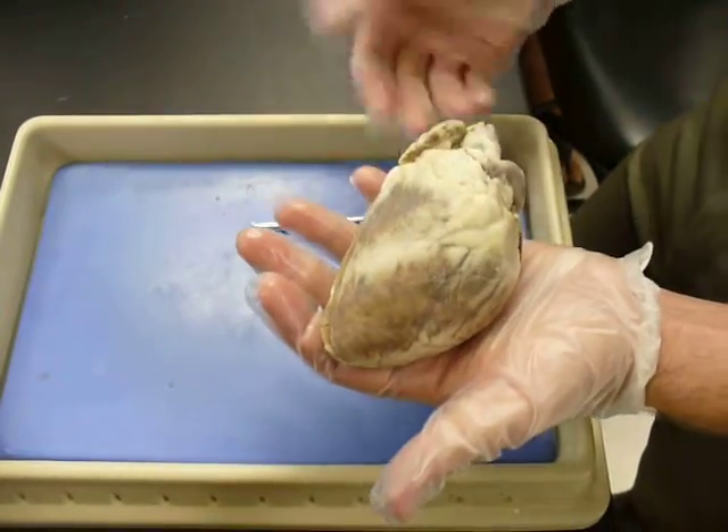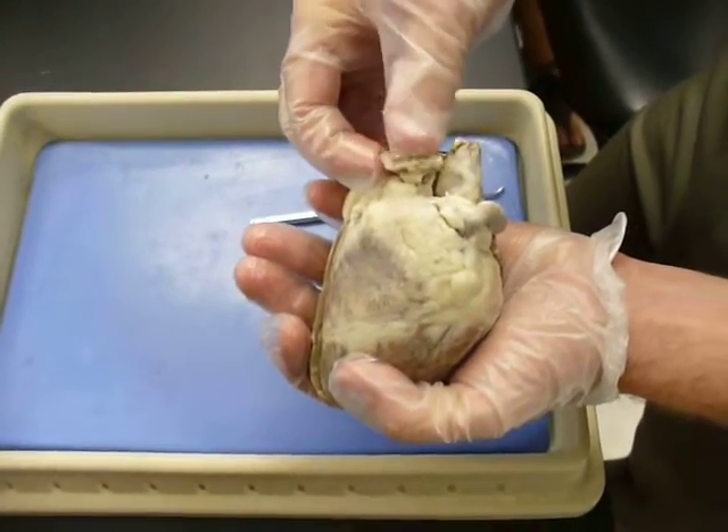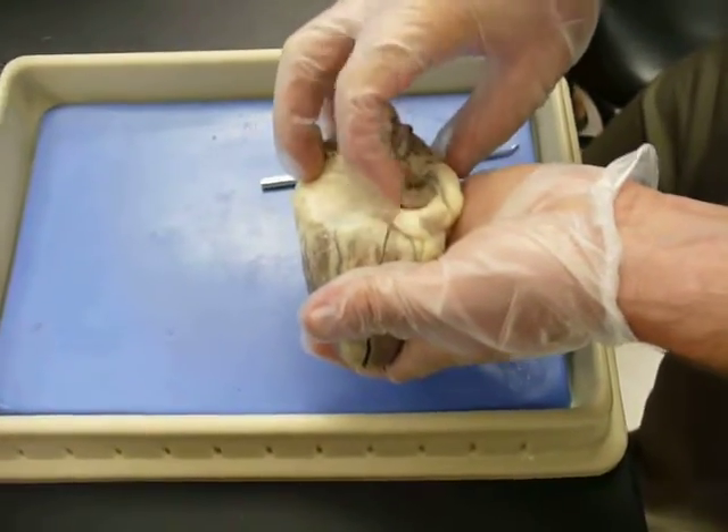From the anterior perspective again, you have the auricles — respectively, your right auricle and your left auricle. They kind of look like little cauliflower ears.